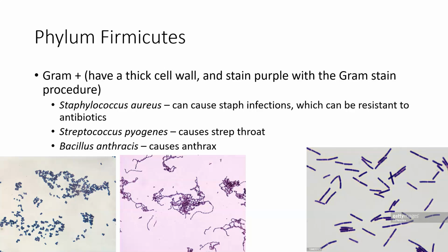All right. Phylum Firmicutes. Some people elevate this up to a kingdom, but we're going to call it a phylum at this level. Everything in this phylum is gram-positive. Now, a gram stain is what's known as a differential stain, and it's called that because it stains different organisms different colors based on the anatomy of the cell wall of that organism.